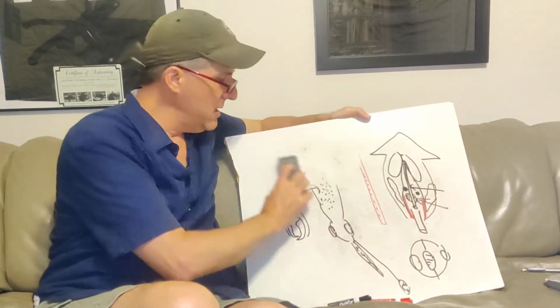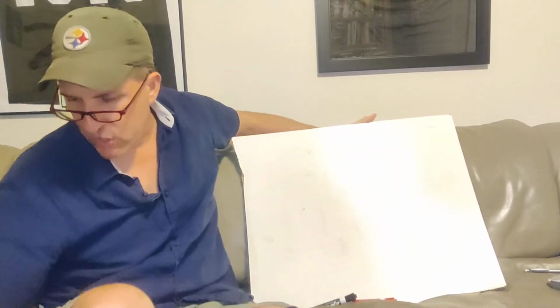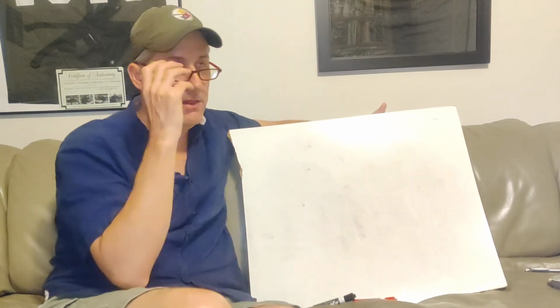All right, so that's the pre-lab for the squid dissection. Hopefully that helps. And last but not least, for this edition, we have to go over another coelomate group called Annelida.